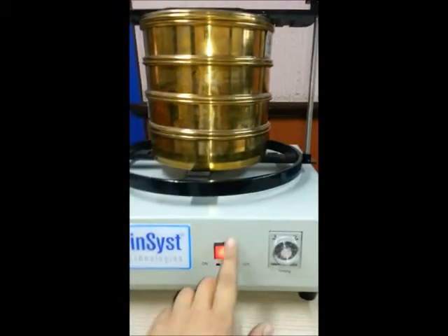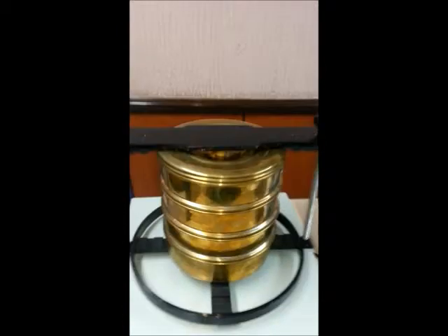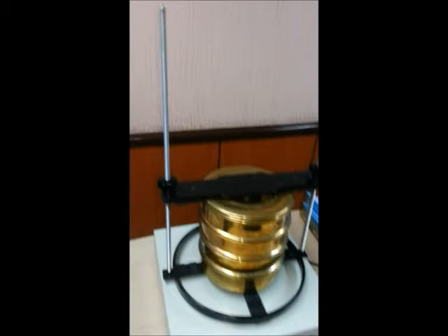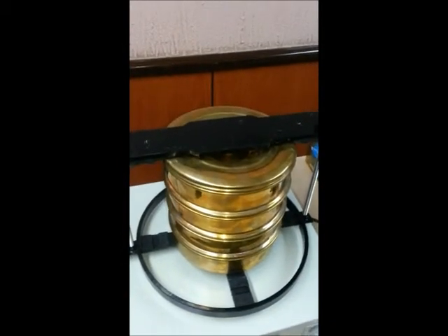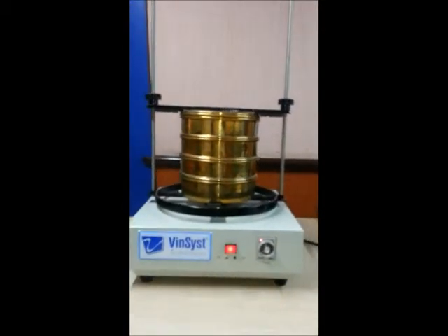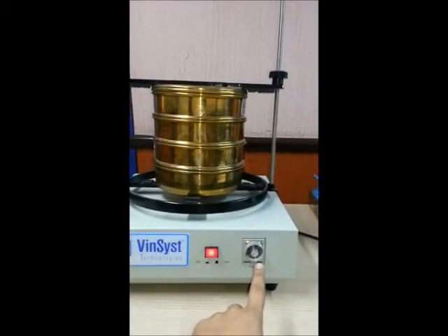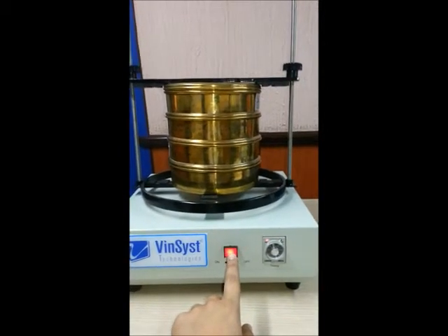Here we start the machine for a demonstration. You can also set the timer, and use the on/off button again to stop the machine.